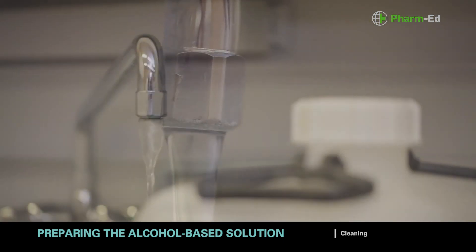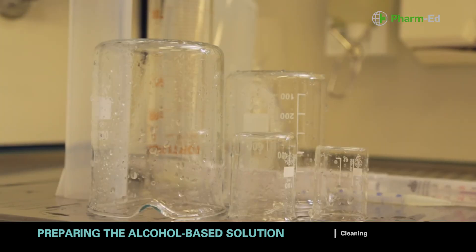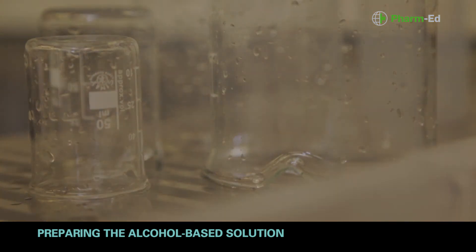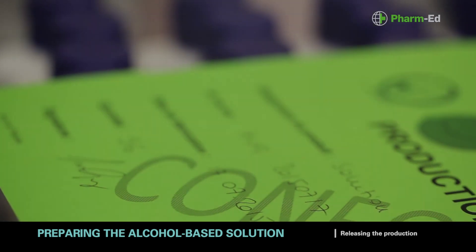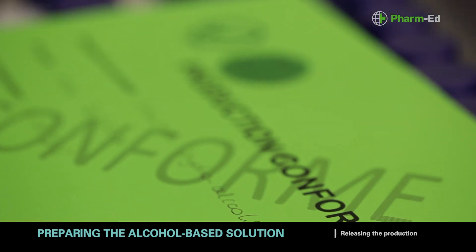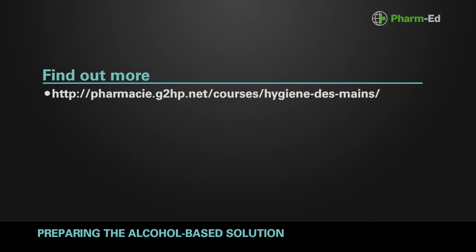After 72 hours in quarantine, clean the equipment used with liquid soap and water, then rinse well to prevent soap residues or marks. The production manager checks that the production sheet and analysis report have been completed and that they conform to requirements. The batch can be released and placed in storage after 72 hours in quarantine. File the reports in a folder to maintain traceability for the batch. To find out more, go to the website shown on the screen.